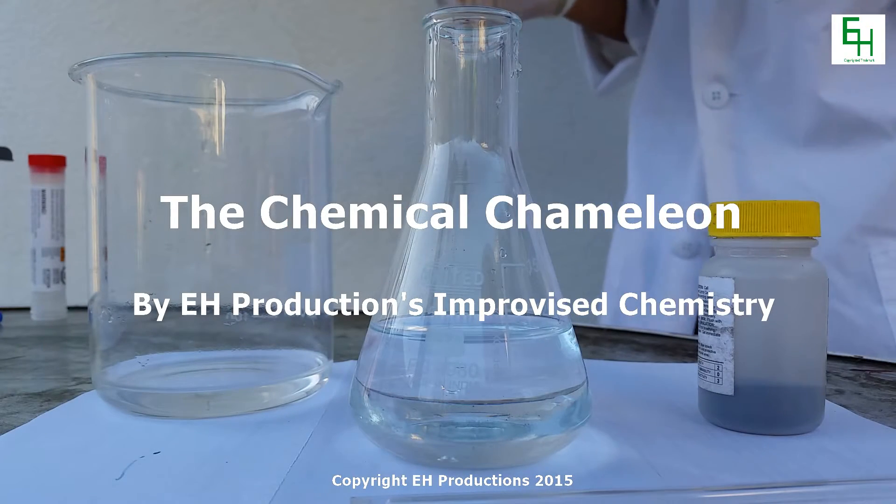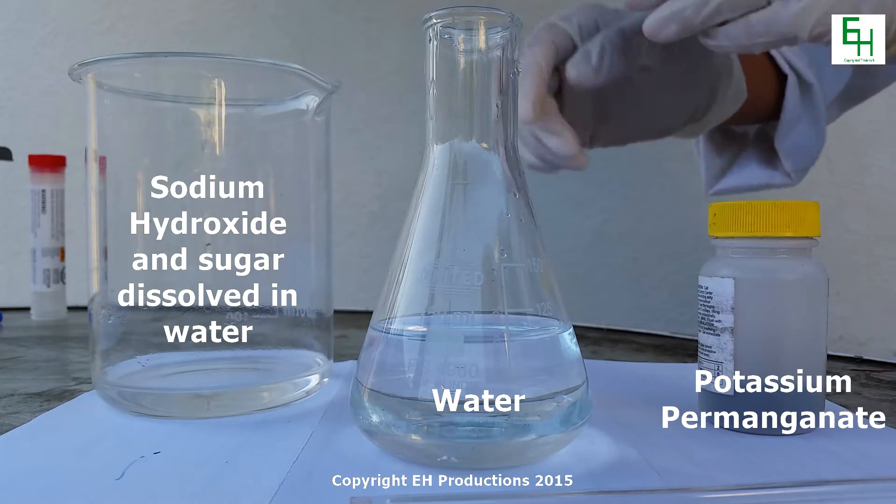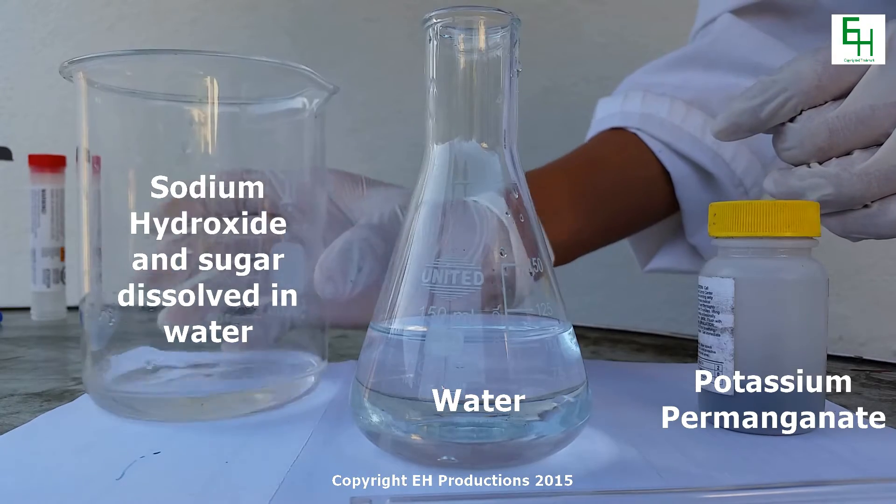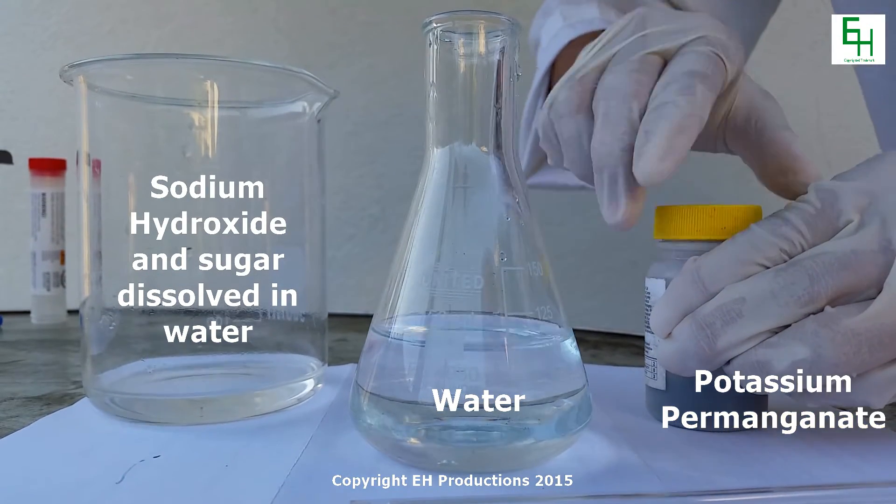Hello everybody, today we'll be doing the classic chemical chameleon experiment where we have a solution of sodium hydroxide and sugar, which I already mixed out over here, and some potassium permanganate and water.